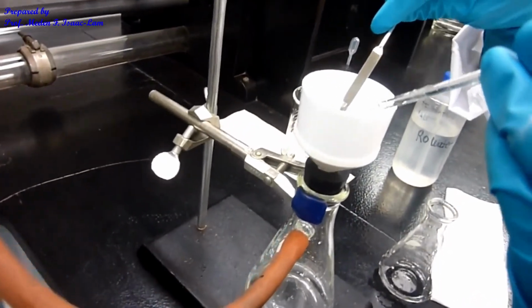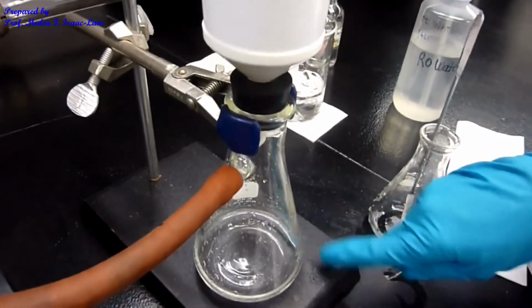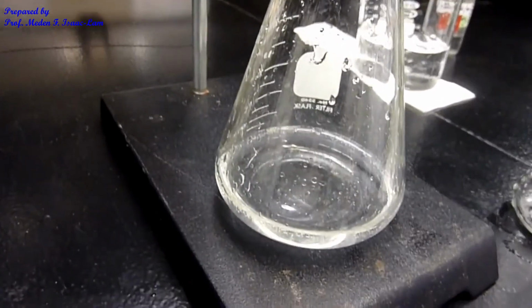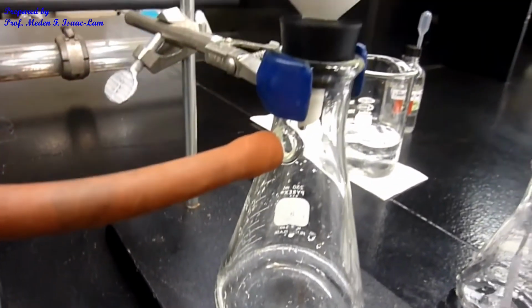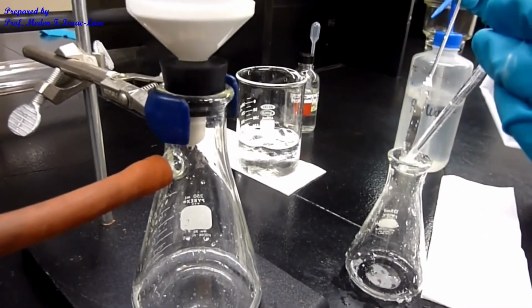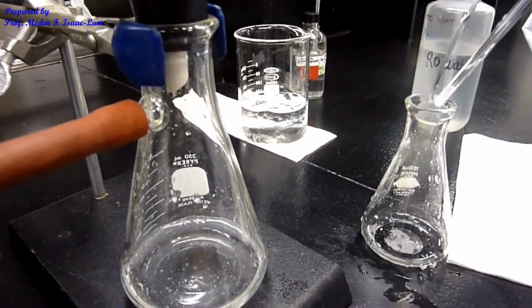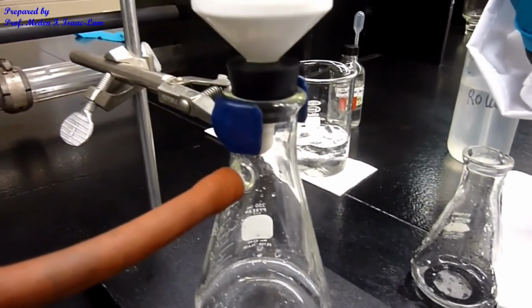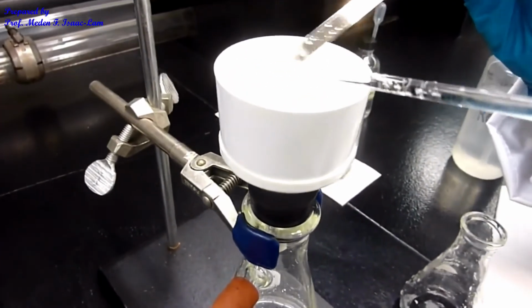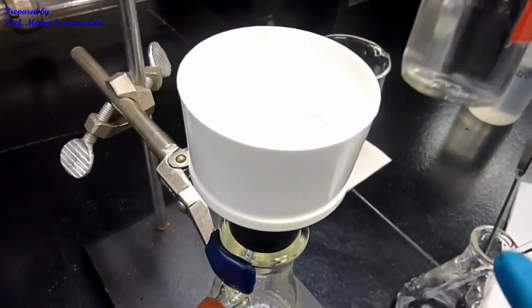And now the precipitate went through, so you don't see anything in the filter flask of any white precipitation. And then I'm gonna rinse it with a little bit of 70% 1-propanol and 30% water, just to clean out a little bit.